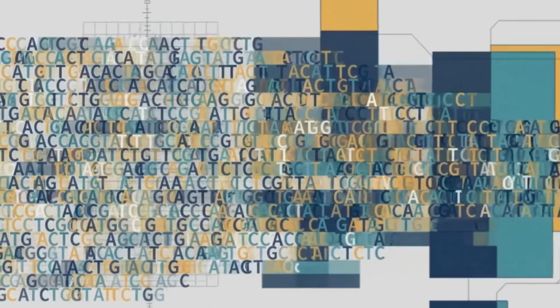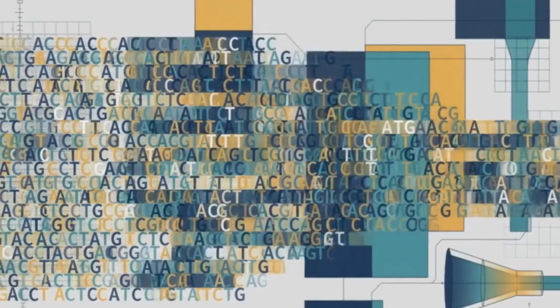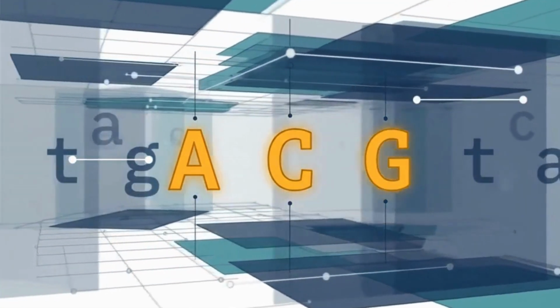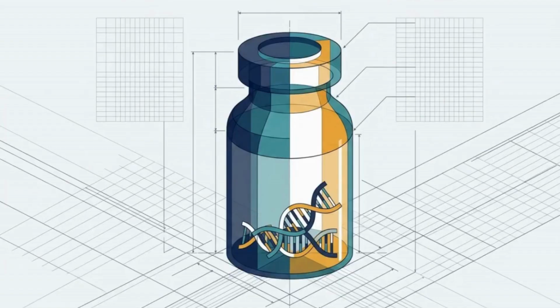But a BAM file still carries the entire weight of the genome, including the millions of identical, healthy DNA sequences we don't care about. The final computational hurdle requires stripping away the 99% of the read that perfectly matches the reference genome. We pour the remaining data into the variant call format, or VCF. This container is designed exclusively to hold the genetic anomalies left behind.